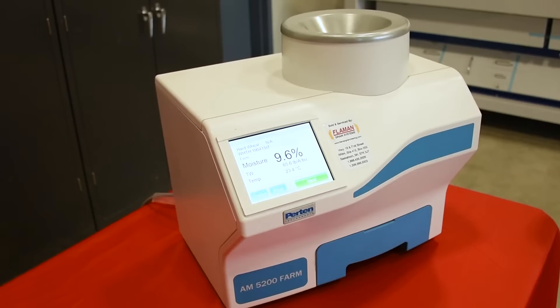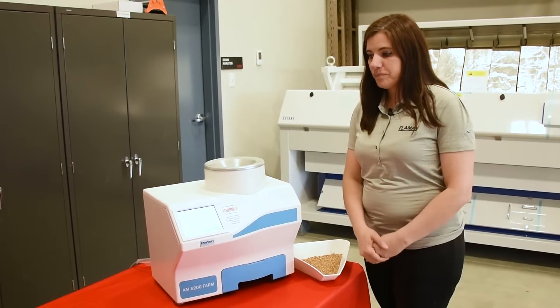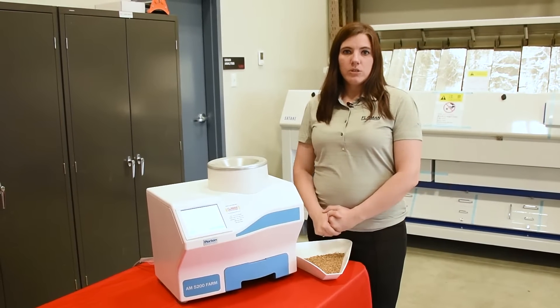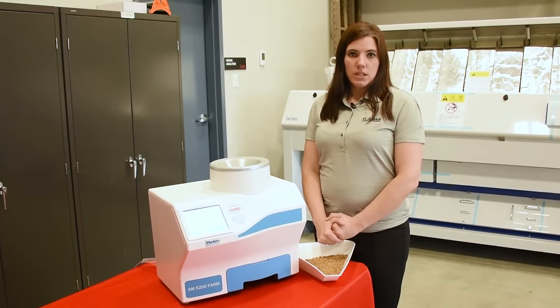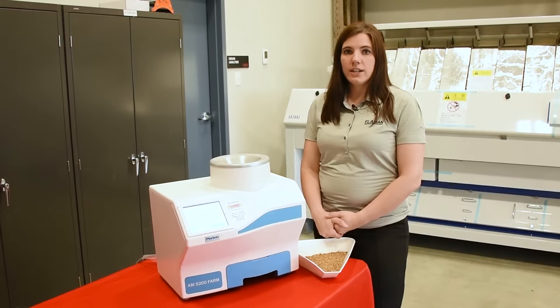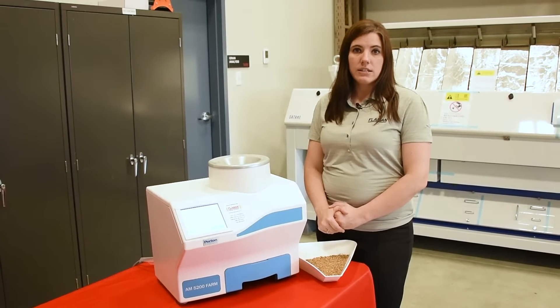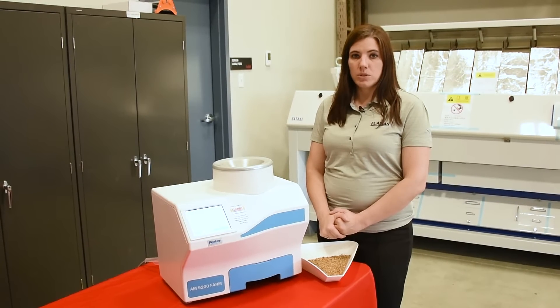If you want to do another sample, you just hit next and it'll save the grain that you are measuring with. This meter, with the high radio wave frequency and the UGMA technology, allows you to test high-temperature grains hot off the dryer or wet grain off the field and still get an accurate and repeatable result.